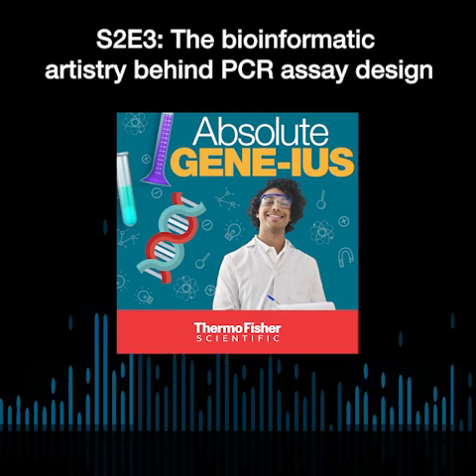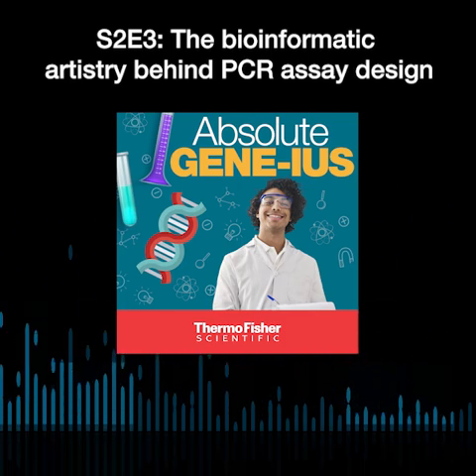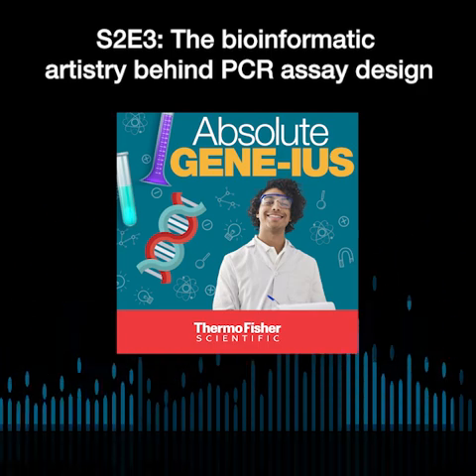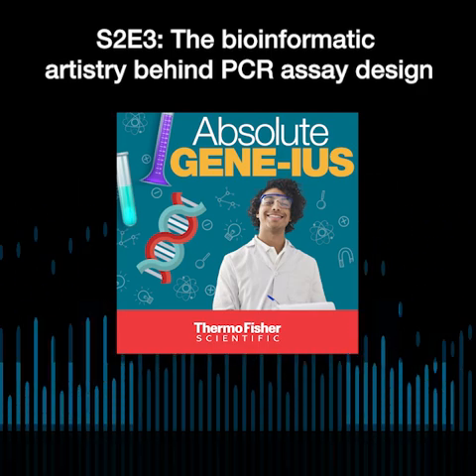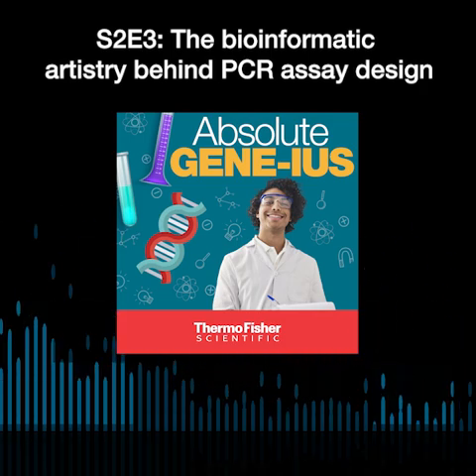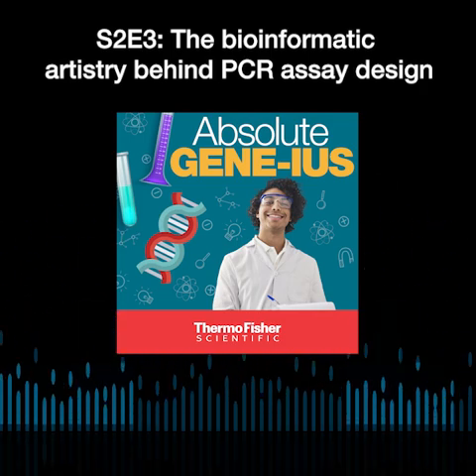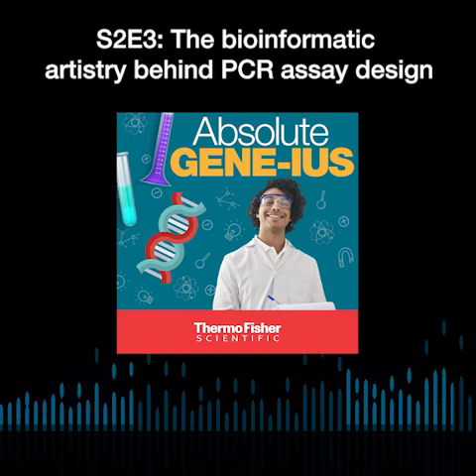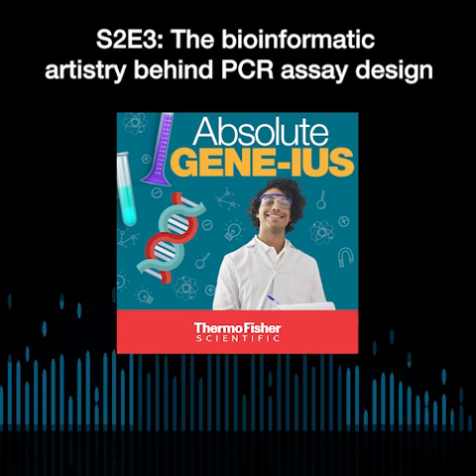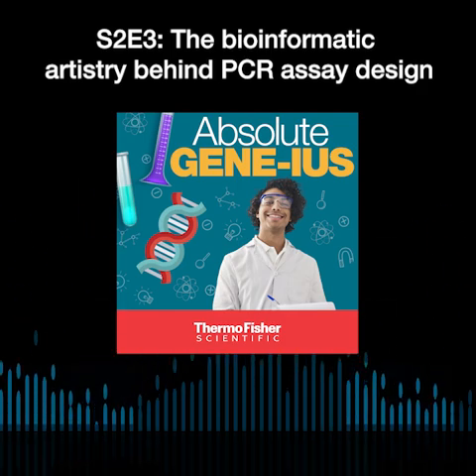So it sounds like a good summary is, it's not just thinking about digital PCR itself, but about everything that's going in, your inputs and your outputs, right? Where the sample is coming from, how intact the nucleic acid is going to be in that particular sample, and what the exact data you're looking to get. Is it multiplex? Is it simplex? Are you trying to avoid primer dimers?